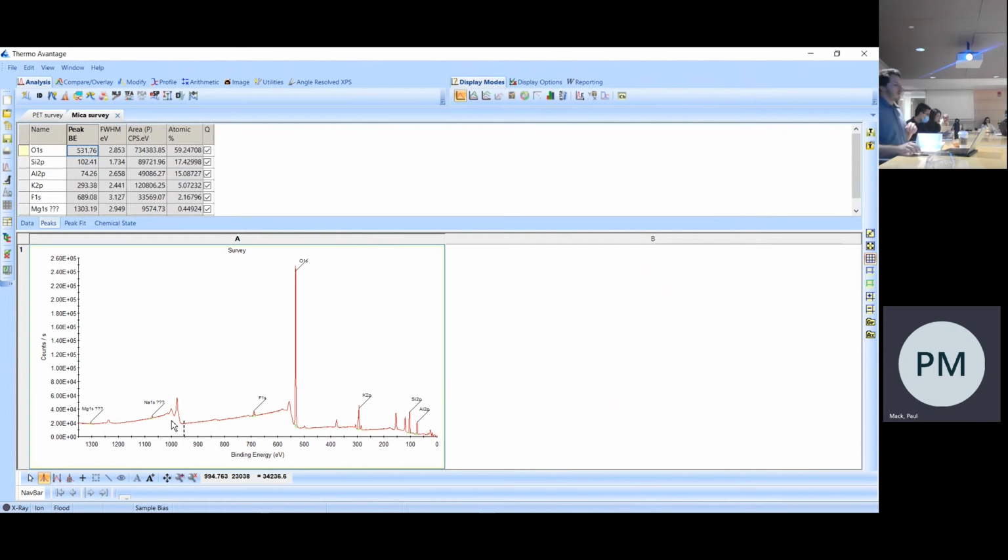In cases like here, though, we have sodium and magnesium. These are very small peaks. Firstly, they're very small, and secondly, because they're so small, we may not have the secondary confirming peaks. In that case, the software puts these question marks next to it. And basically what the question marks mean is go and have a look yourself.